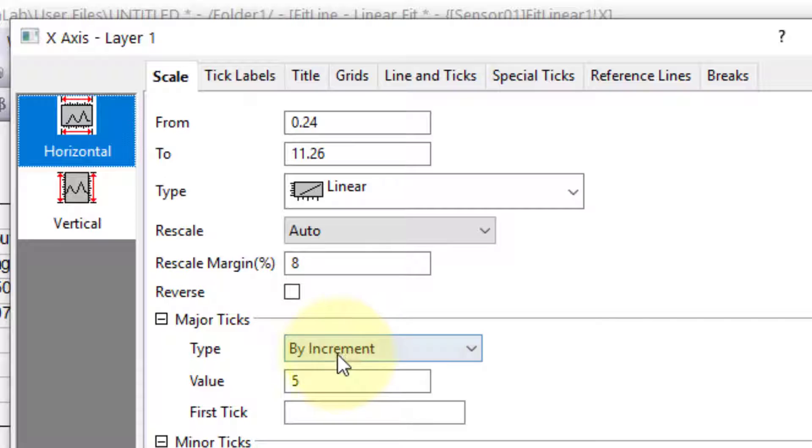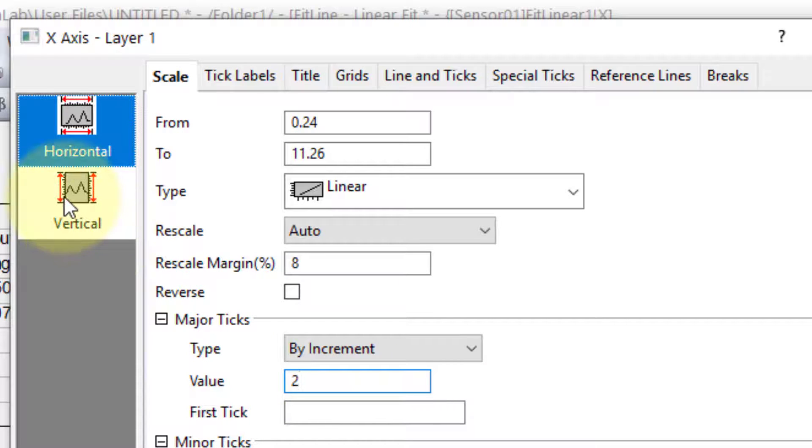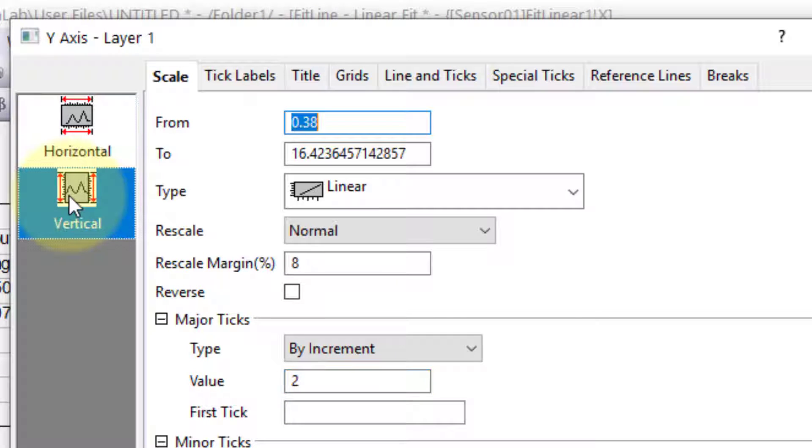Type will remain by increment, while the increment can be changed to a lower value. We can do the same changes for the Y axis as well.